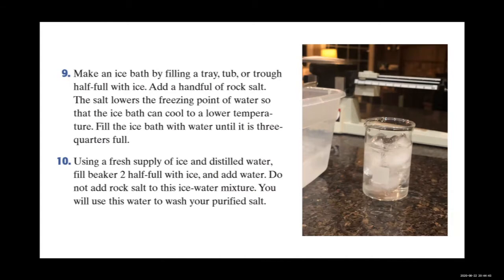Using a fresh supply of ice and distilled water, fill beaker 2. I forgot to stick a number 2 on that, but that's beaker 2. Fill beaker 2 half full with ice and add water. Do not add rock salt to this ice water mixture. You will use this water to wash your purified salt.